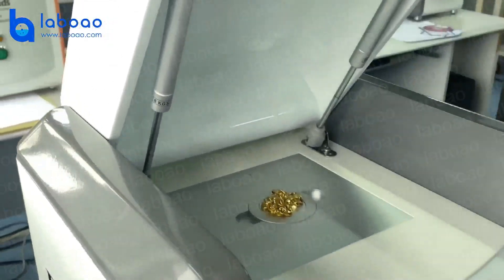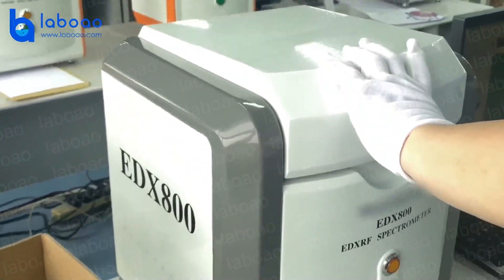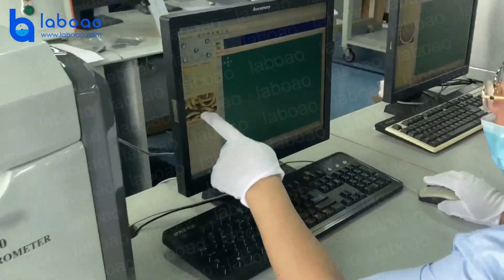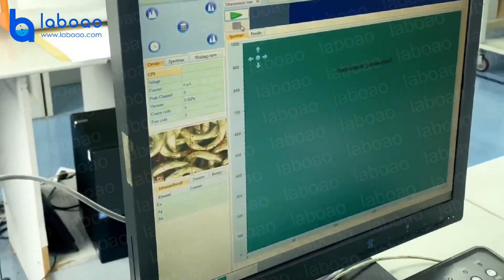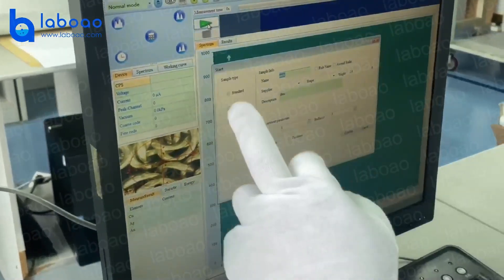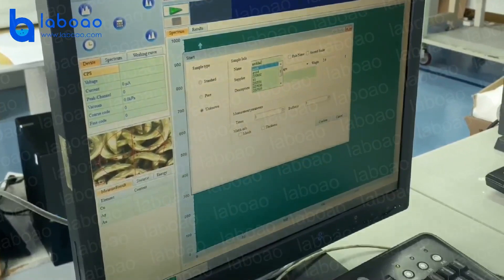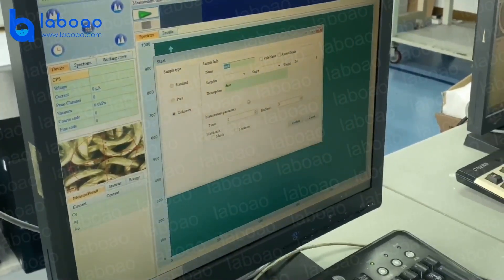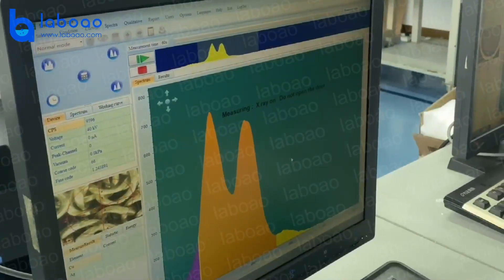Put it in the middle, and then come here. With the camera we can see the sample. For the test, it's very simple: here we click start, give the name, and confirm to go on.